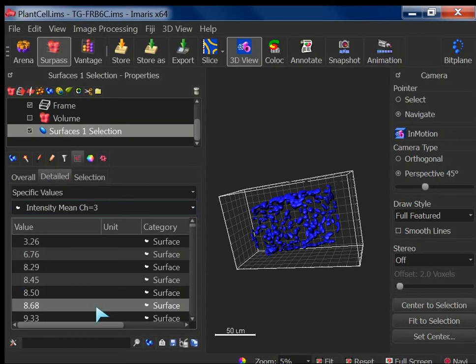In that scenario, or maybe the scenario that I explained, you first segment DAPI and lay over that DAPI channel on the foci channel, and then you run a spot detection algorithm on the masked foci channel. Yeah. So there are different ways to decide. But if you just want to quantify them, this is the way. Yeah, but you have to select the right one. You have to select the one with the original data that you just applied on. Exactly. One should know that.